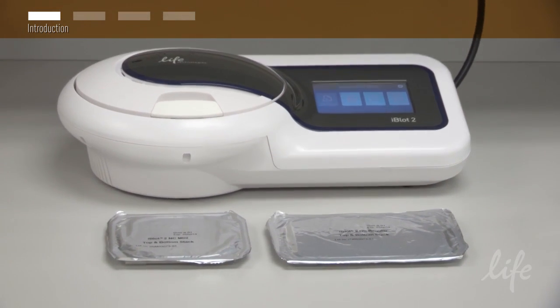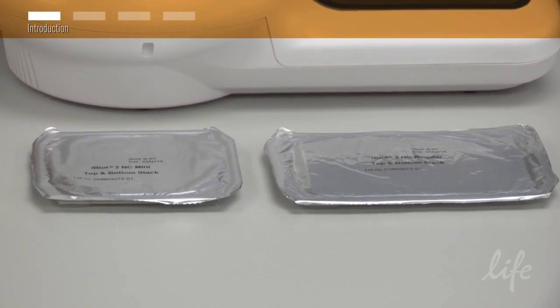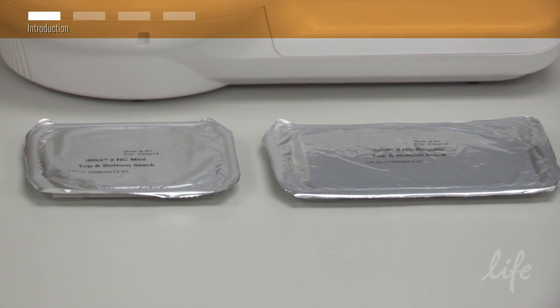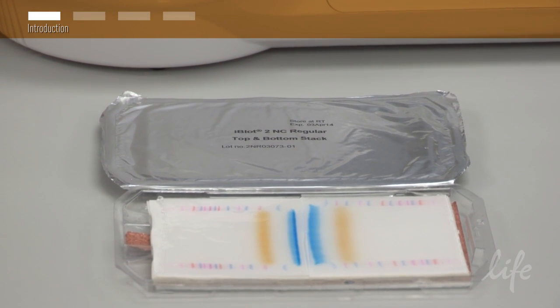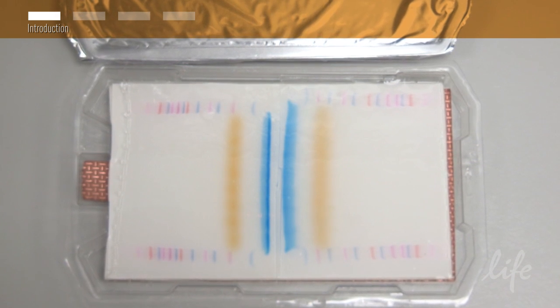The iBlot2 dry blotting system can transfer proteins from mini or midi sized gels. In fact, two mini sized gels will fit on a single regular sized iBlot2 transfer stack.